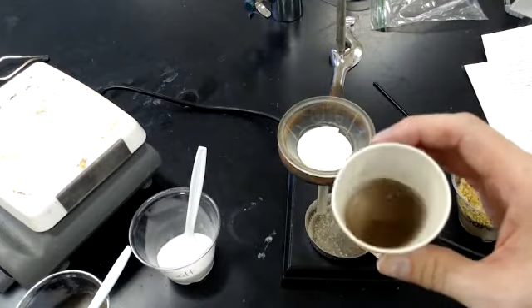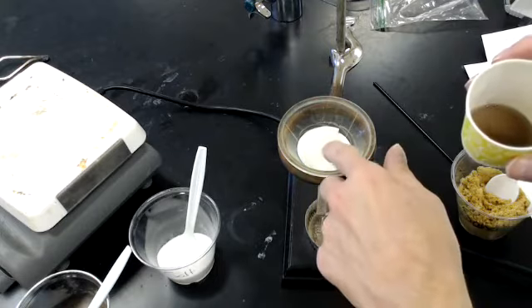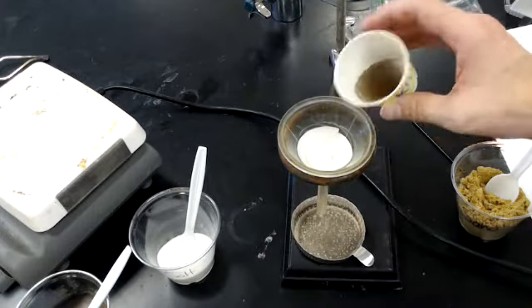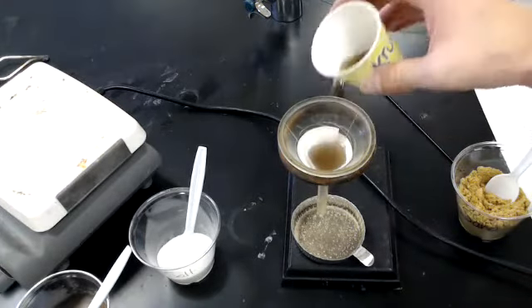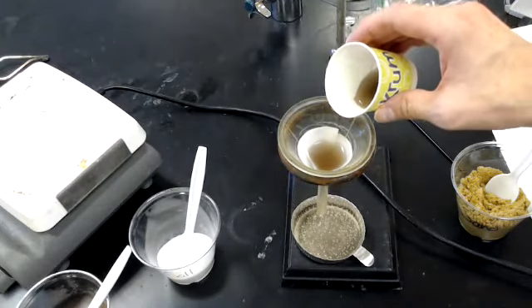Okay. And now I'm going to filter it. So I'm going to pour this through the funnel. I'm going to catch it in this aluminum evaporating dish here. And so let's see, this is a final little swirl. It doesn't work amazing, but it works kind of. I want to be careful not to overfill the filter paper.